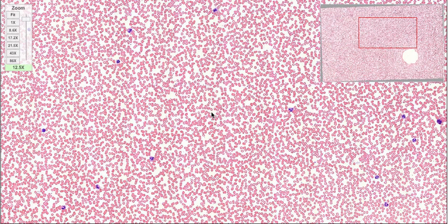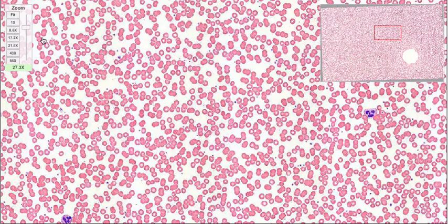What we're going to do here is try to keep it under 10 minutes, and look at a histological blood smear, where we're going to look at a range of cells that we find circulating within our blood. The first cell, and probably one of the most important cells, is the red blood cell.